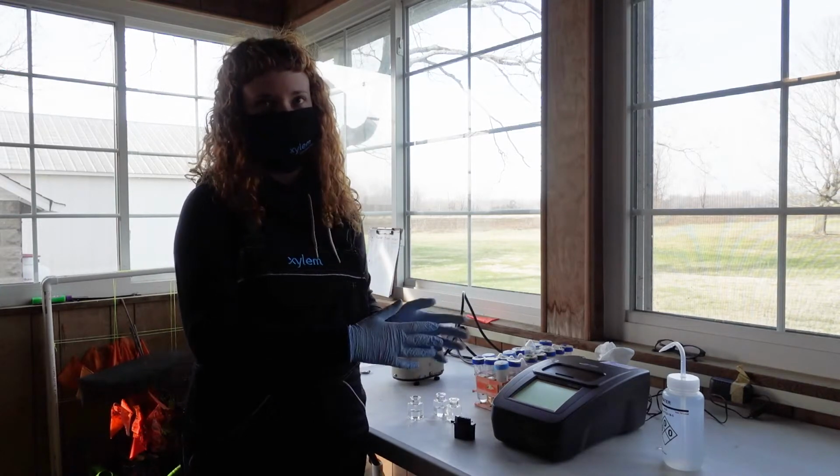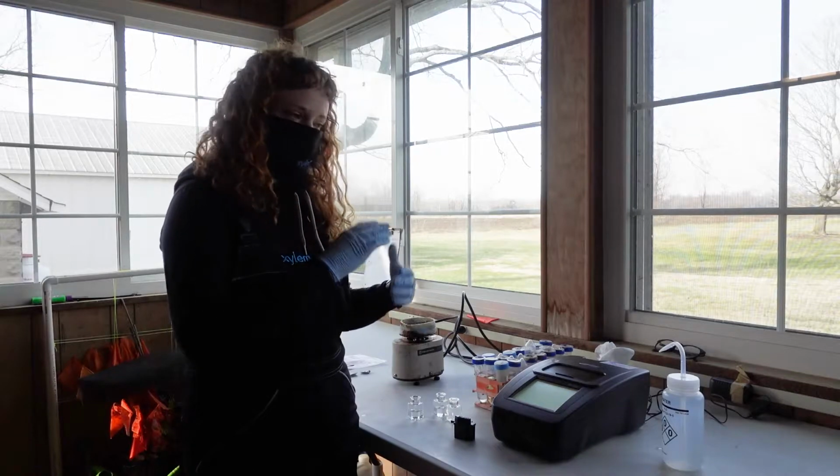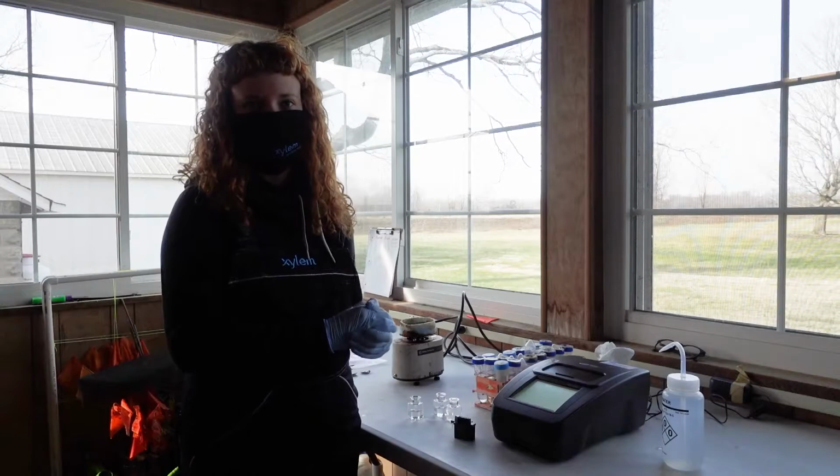This method will be set up for you. If it is not, or if at any point during the day you lose the method, find a laboratory manager and they'll help you set it up.